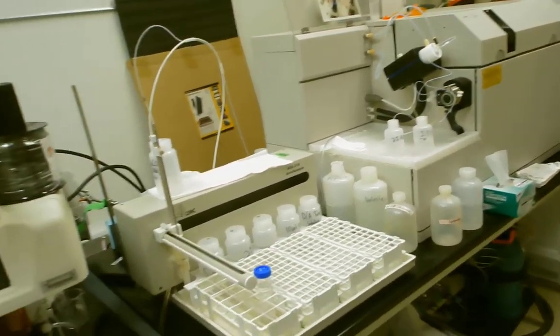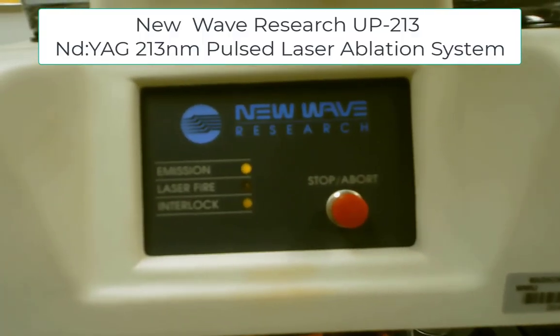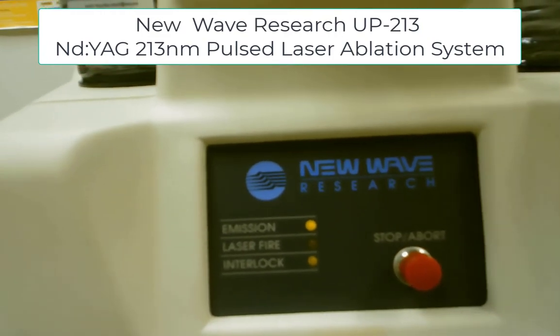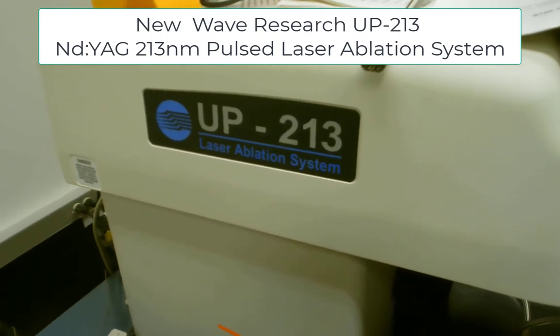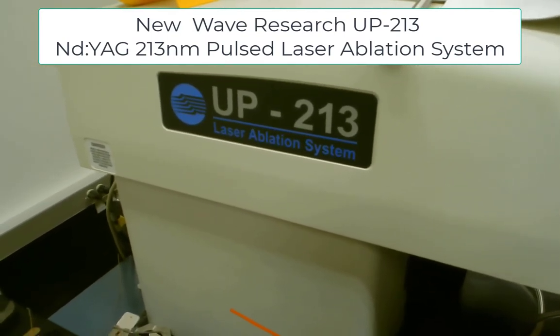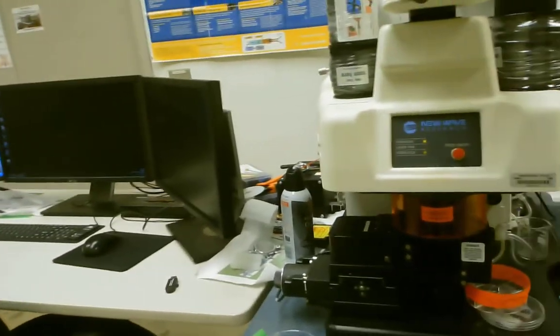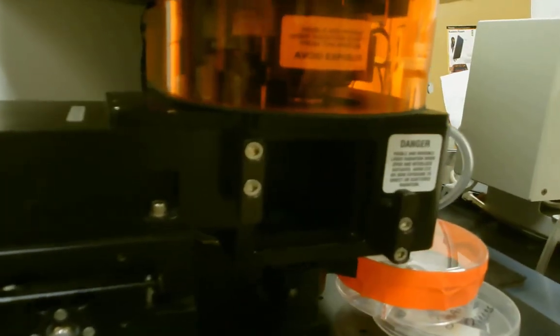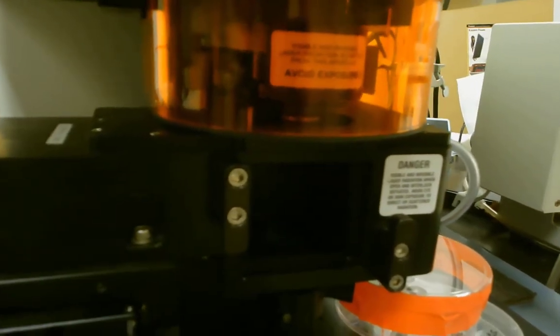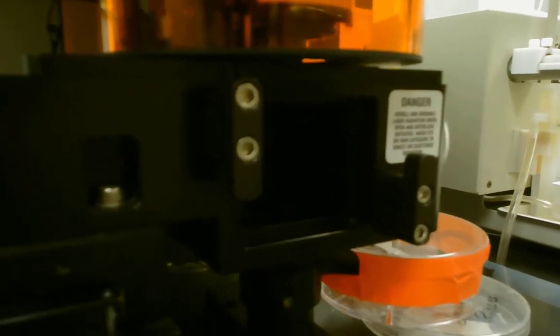So let's first take a look at the laser ablation system. So this is a New Wave Research UP213 neodymium YAG laser. So it's a 213 nanometer deep UV laser. So this thing uses a helium carrier gas. So our cell is located down here, and it's a little hard to see, but right in here is where we put our sample holder.